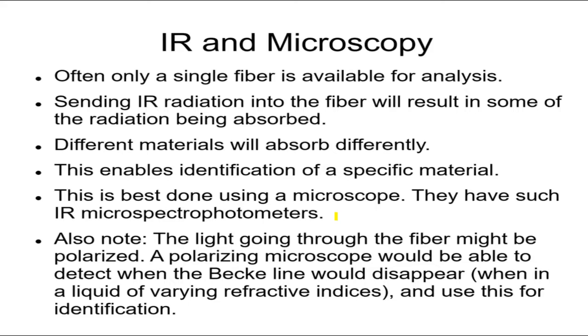Don't get me started on that, but in any event, when you match the infrared spectrum that you get from this microspectrophotometer, you can identify exactly what the dye was. And this enables you to make a very good comparison because we know exactly the same dye was used. Again, that forms a good connection. But as we mentioned, it's not just one shirt that's sold.